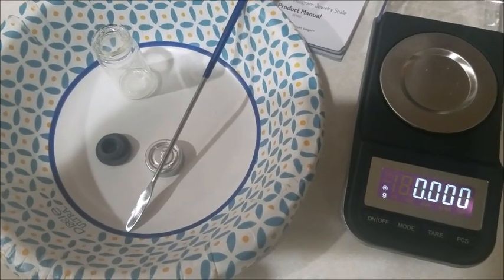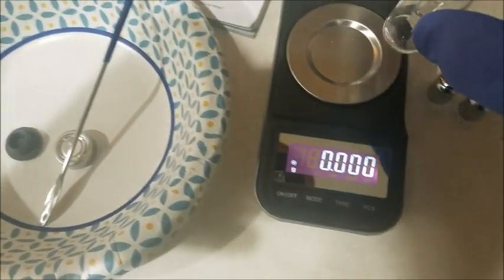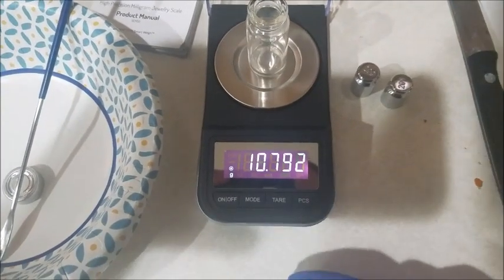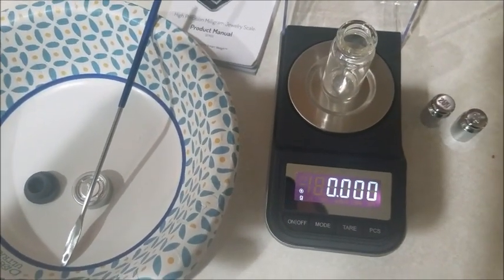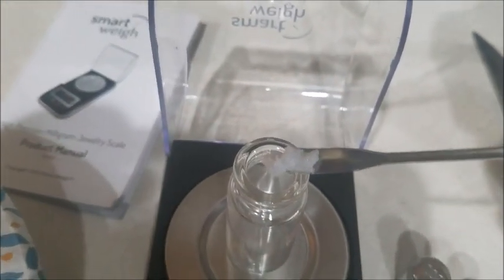Now that we've washed our hands good and gloved up, we're going to take our sterile vial and we're going to set it on our scale. Now we're going to push the tare button to reset the scale to 0. Next, we're going to get our lidocaine. Now we're going to take our micro spoon, dip it in our lidocaine powder, and bring it out very carefully. We only need 1/4 of 1 gram.